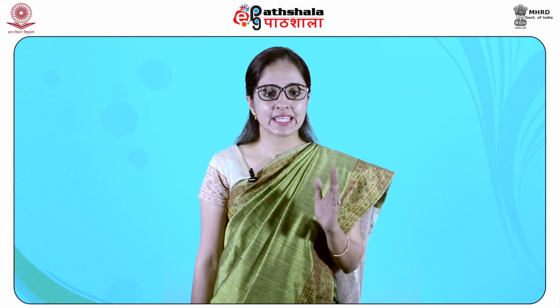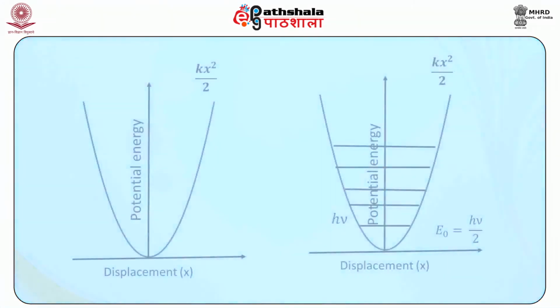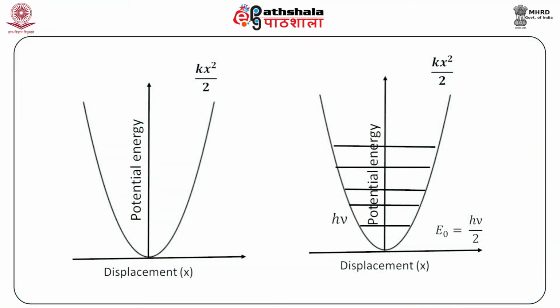Thus, the energy or frequency is dependent on how far one stretches or compresses the spring, which can be any value. If this simple model were true, as you can see, a molecule could absorb energy of any wavelength. Now, you can see the ideal harmonic oscillator and its energy curve in this figure.